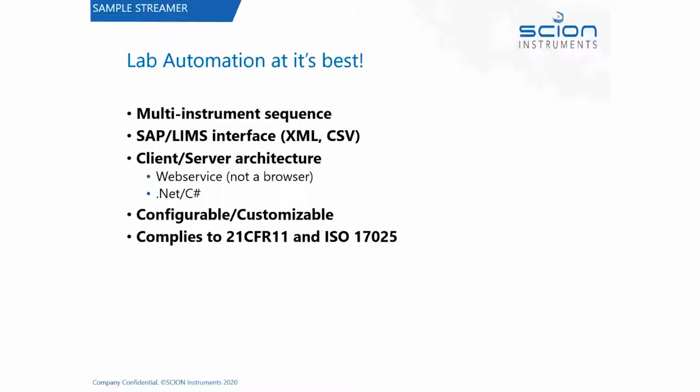You can install one PC and instruments, and perhaps it's a very short analysis time. Keeping track of all of those samples across all of those instruments is not straightforward. So it's very customizable, very configurable. Not only that, it does comply with 21 CFR 11 so that you can track and audit everything that went on, all the samples that were done, all the samples that failed, you have the complete story. And that is important in a CFR 11 environment.